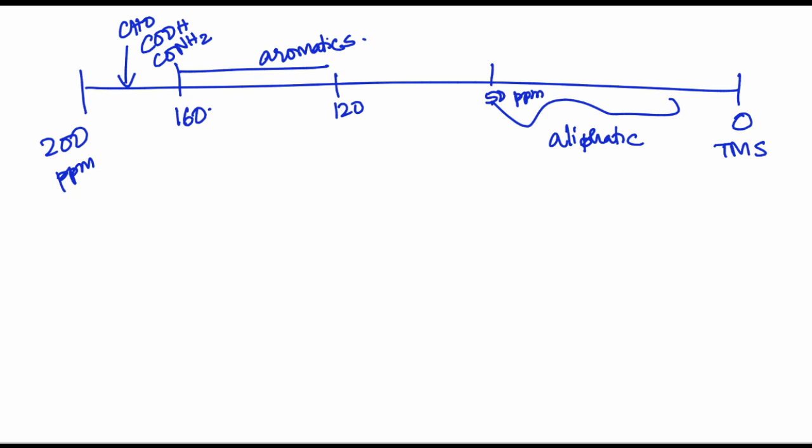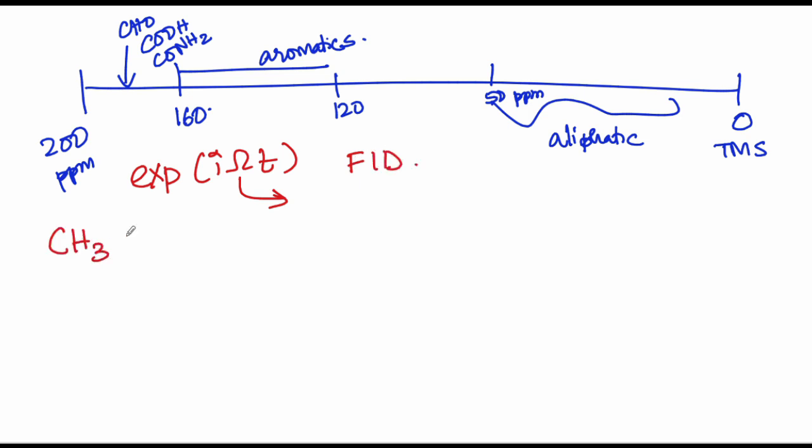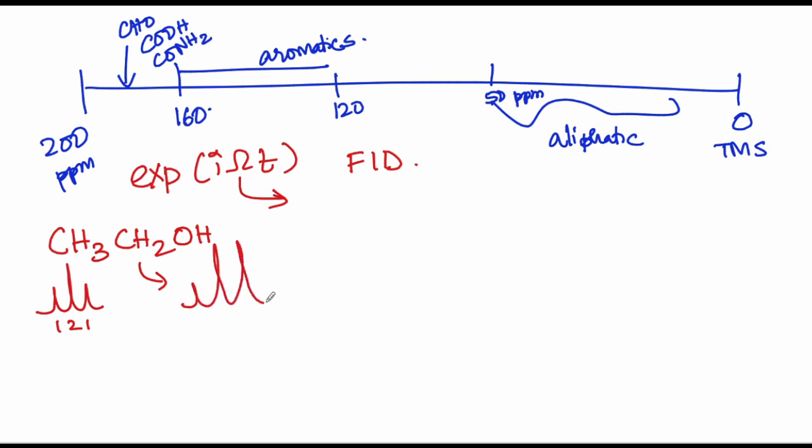Now, having taken a closer look at chemical shifts, let's ask the question, what else can we extract from the offsets that we measure as an oscillation in our free induction decay? For the ethanol spectrum, we also spoke about the fine structure splitting that makes the methyl group a 1:2:1 triplet and the methylene group a 1:3:3:1 quartet. Right now, we will focus on this parameter which is called scalar coupling.